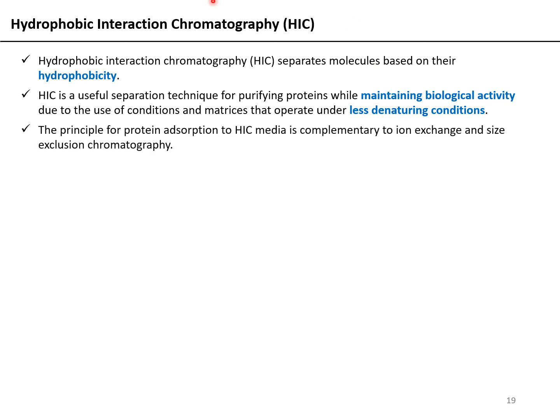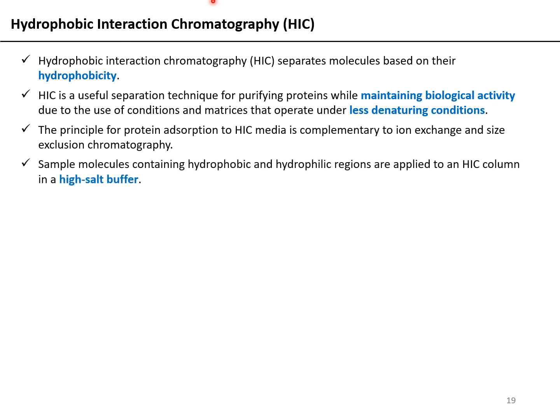The principle for protein adsorption to HIC media is complementary to ion exchange and size exclusion chromatography. Sample molecules containing hydrophobic and hydrophilic regions are applied to an HIC column in a high salt buffer. The salt in the buffer reduces the solvation of the sample solutes.